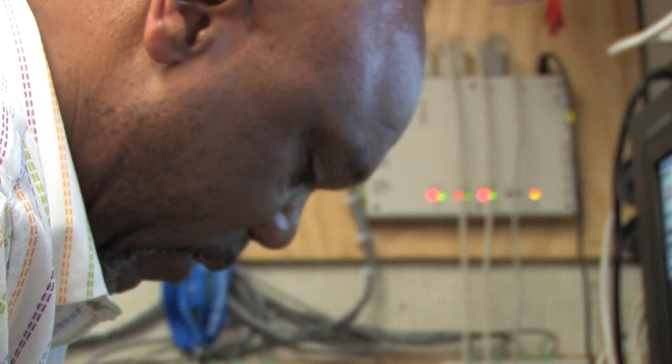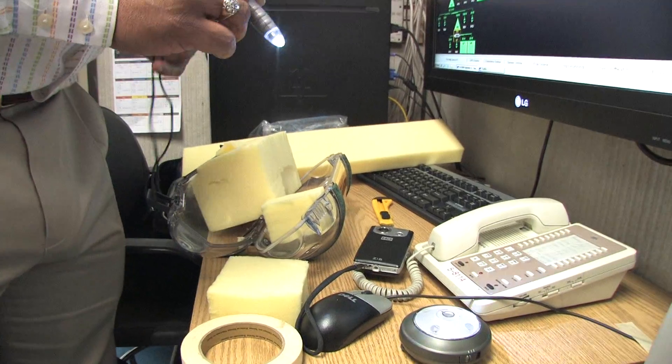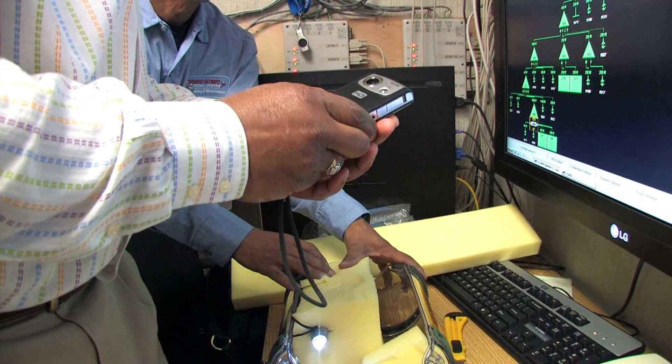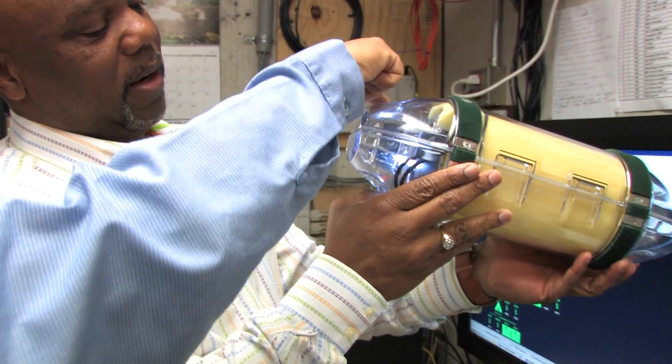We're in the process of trying to visualize what happens when the pneumatic tube takes off in the system. We're going to be putting a light and a camera inside this carrier and we're going to send it off and see what type of video we get out of this.